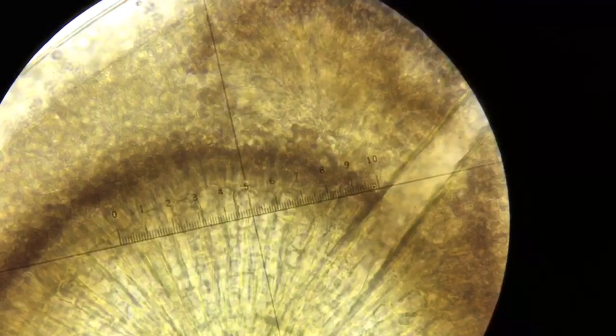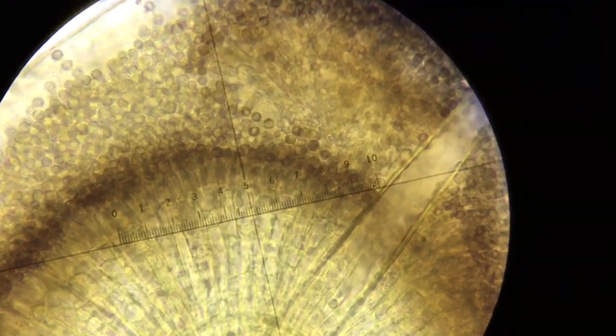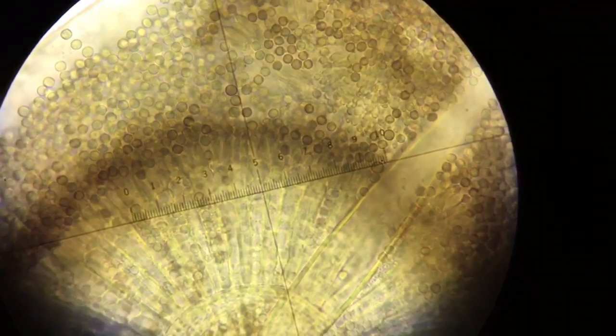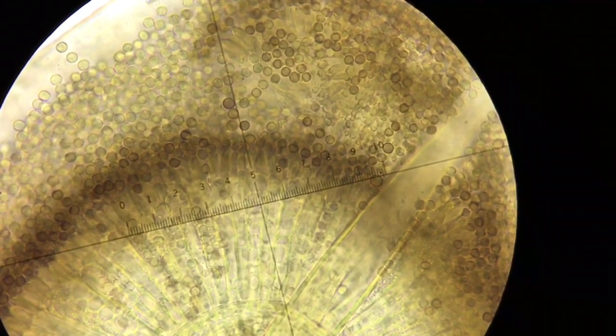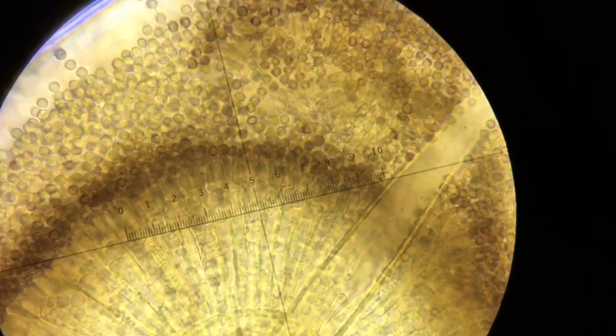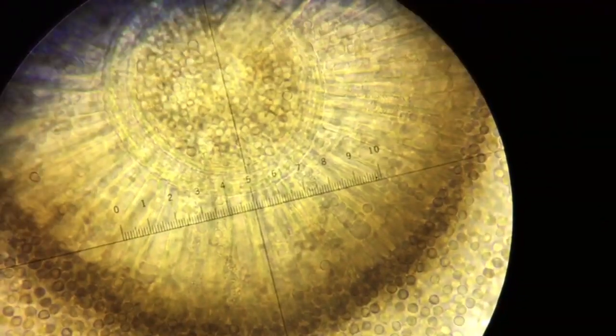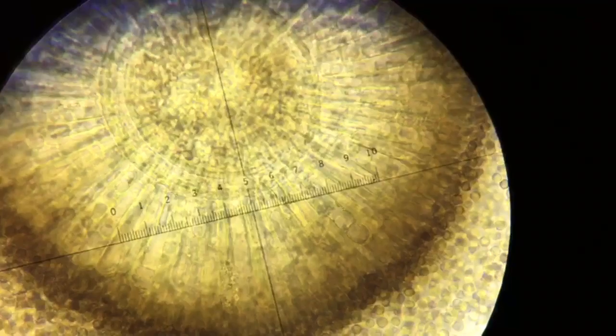In Aspergillus Niger, this is called a biseriate conidiophore. A uniseriate conidiophore does not have those base structures; it only has the phialides. The base structures are called metulae, and then you have the phialides that come off of it.